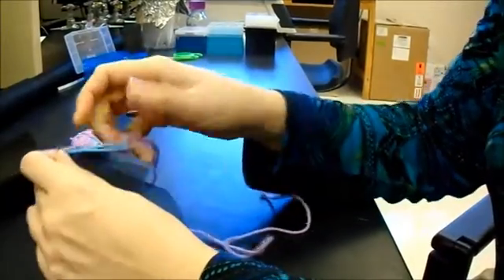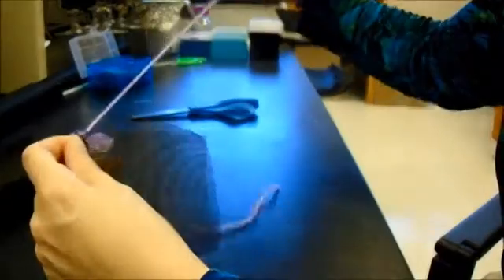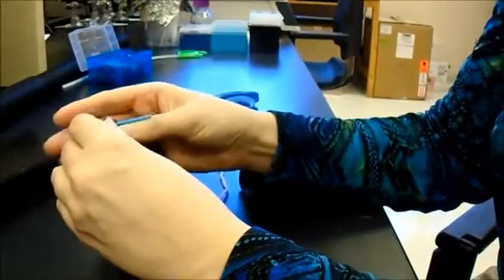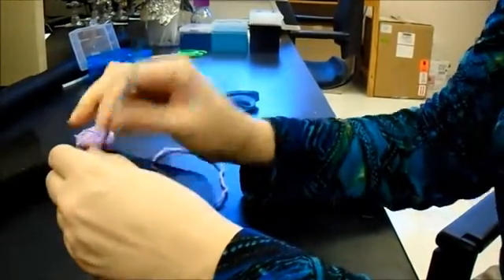I use a basic running stitch. You just want to make sure that your stitches are close enough together that none of the plant material falls out of the bag. Continue that running stitch all along the first edge.